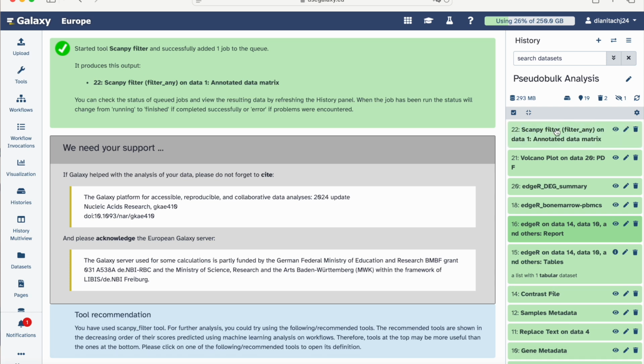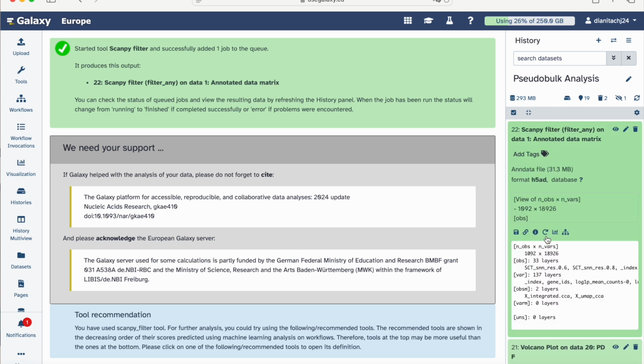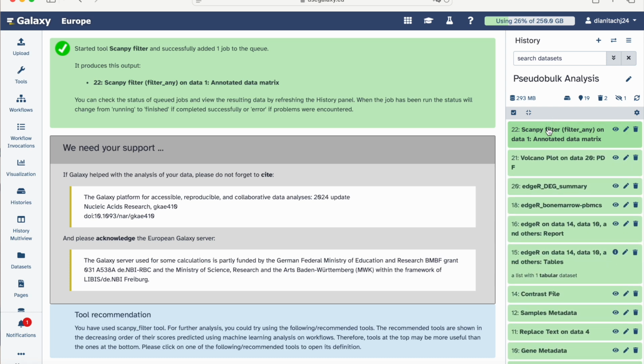Great. Our file's ready. And now we see here that we only have the dendritic cells, which are 1092, and of course the whole set of genes that are expressed, and then we will know whether they are expressed in one cell or not, and so on. But this is data extracted only of this cluster.